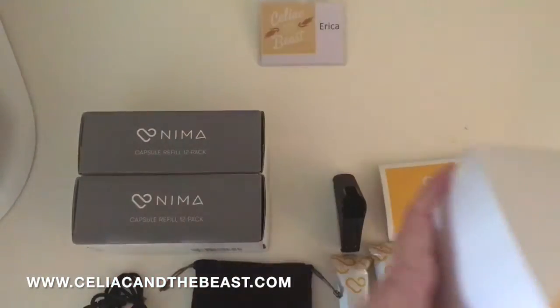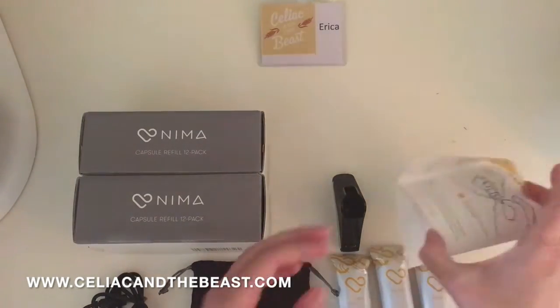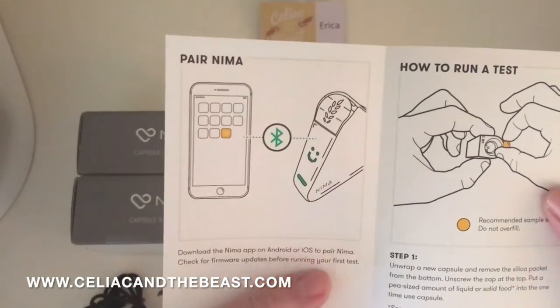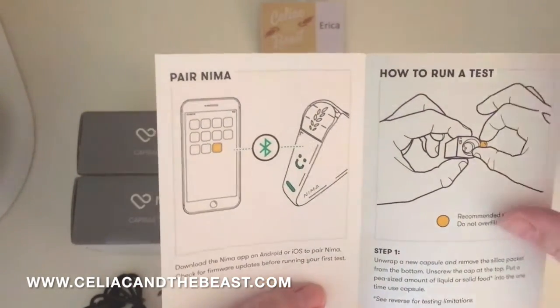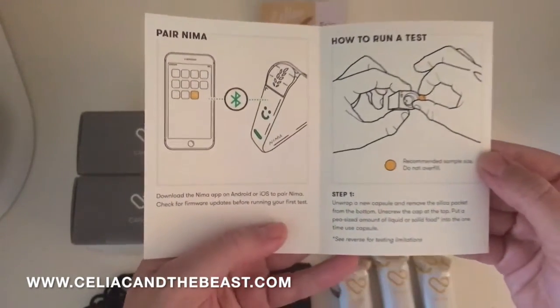Look at the beautiful branding. And then let's look at the booklet — getting started. You pair NEMA with your iPhone. And for running a test, it shows you how to use a pea-sized amount of food.